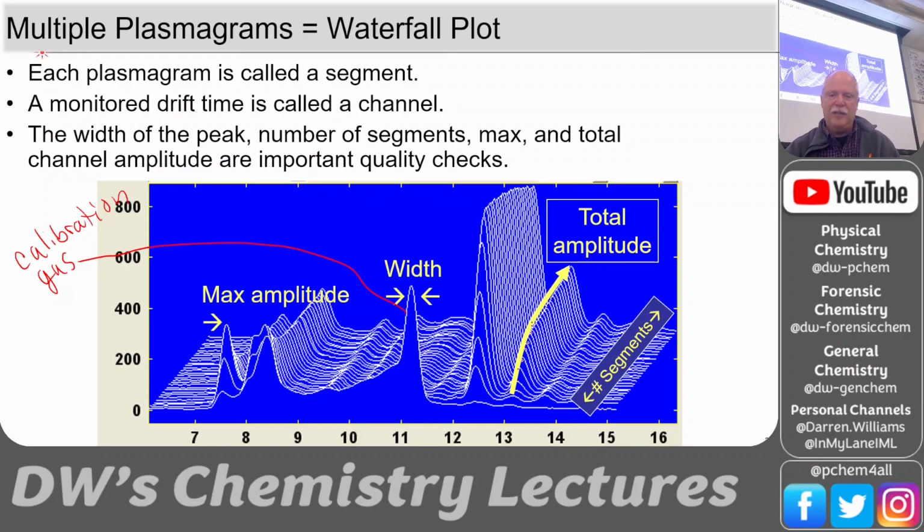You see how this stable signal is developed. You get a total amplitude, you get a width, and you get a maximum, like this would be the maximum of your sample.